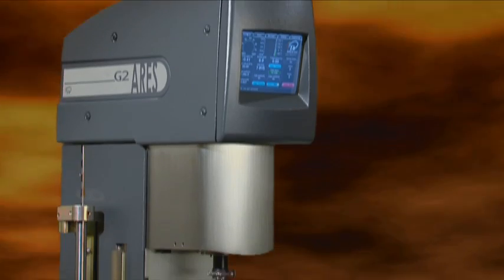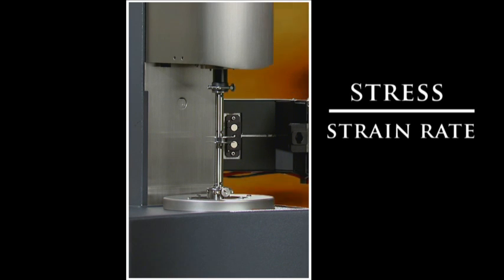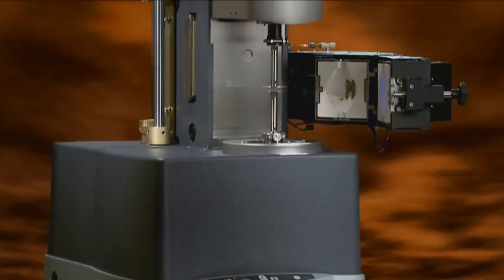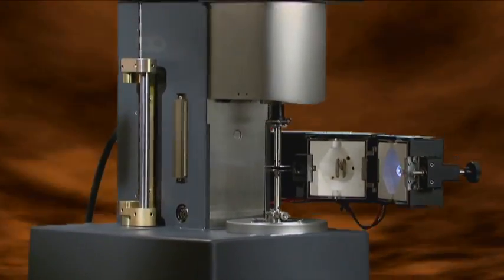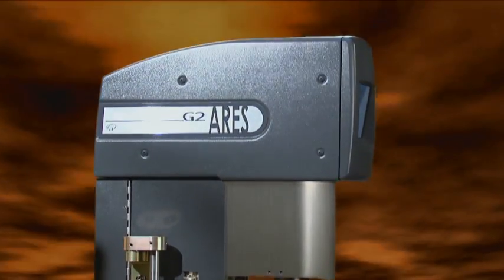In order to make the purest and most accurate rheological measurements, it is essential to measure the fundamental parameters of stress and strain or strain rate independently. Only the patented design of TA Instruments' new ARES G2 allows the rheologist to measure stress and strain independently.